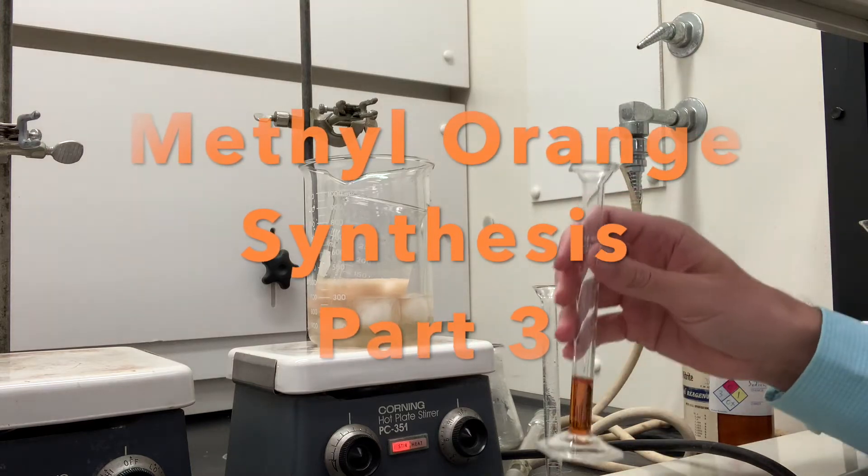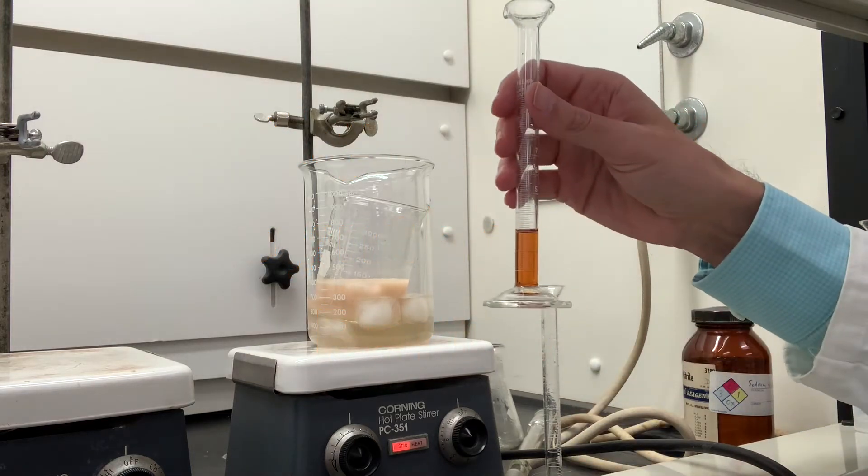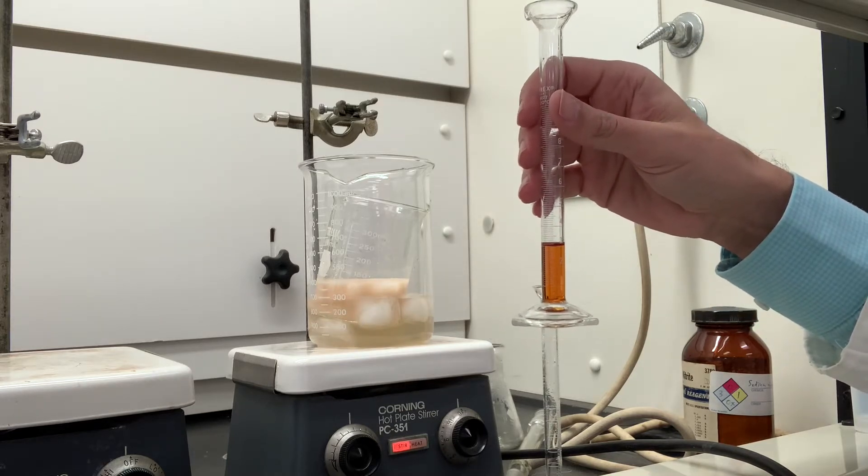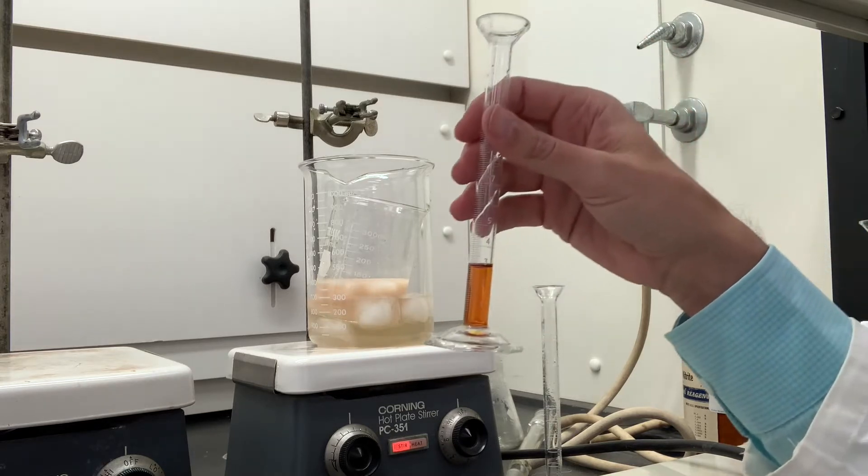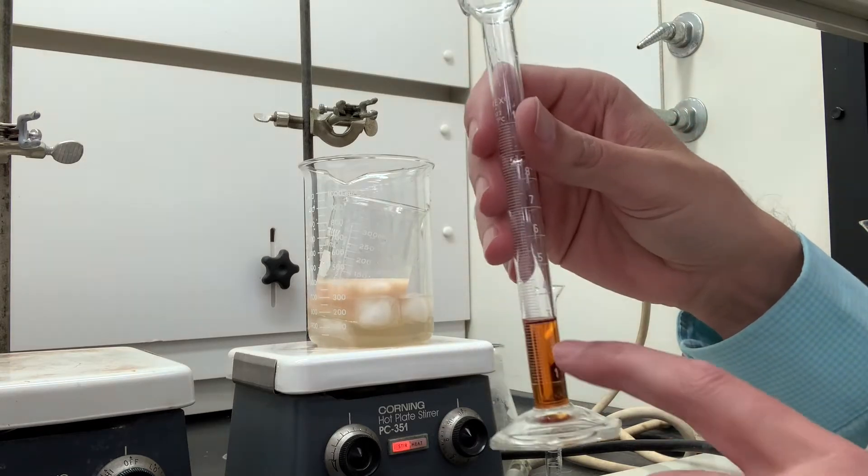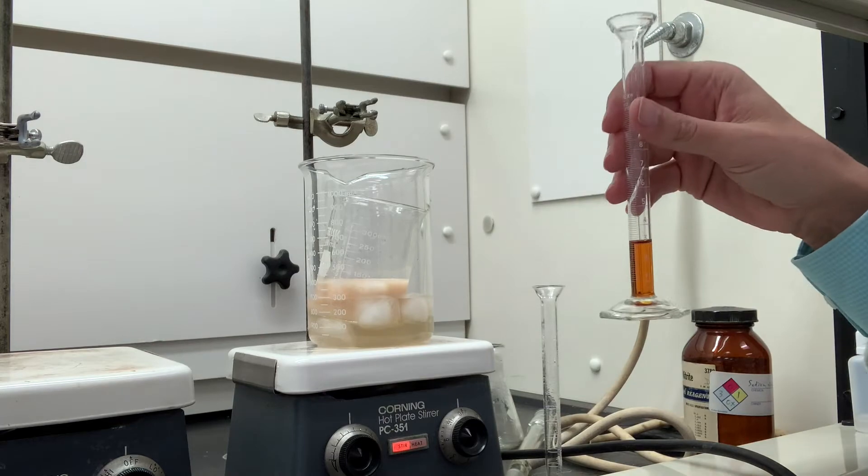Now what we want to do next is in a fume hood, measure out 2.8 milliliters of this NN dimethyl aniline using a 10 milliliter graduated cylinder as I've done here, and you want to wash that.